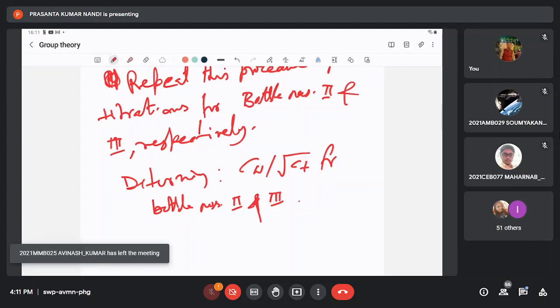So the remaining part of the procedure, I will try to send it by email, but without data. So this is the procedure. And how to standardize the supplied NaOH, which is approximately N by 10, with oxalic acid. Can you guess how we can standardize?